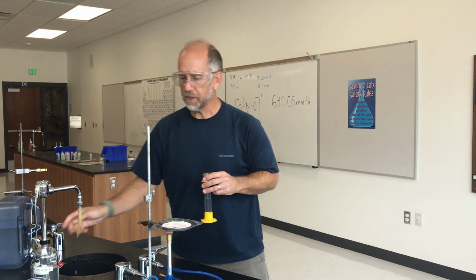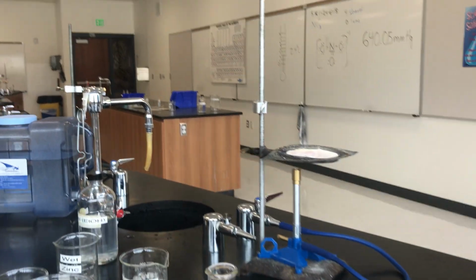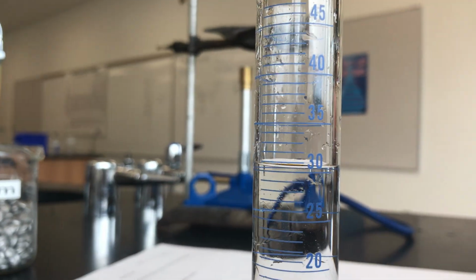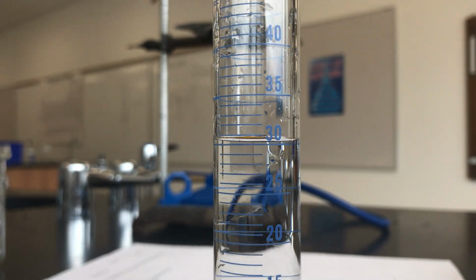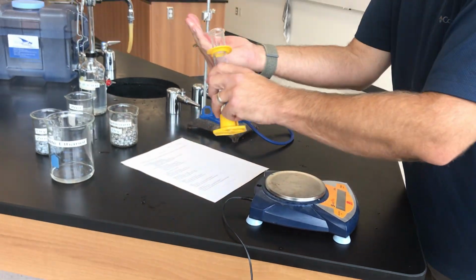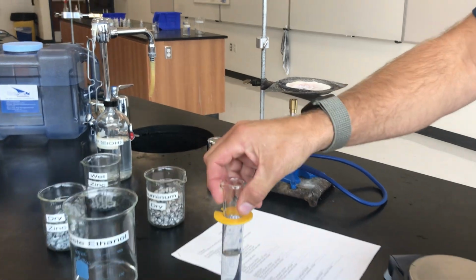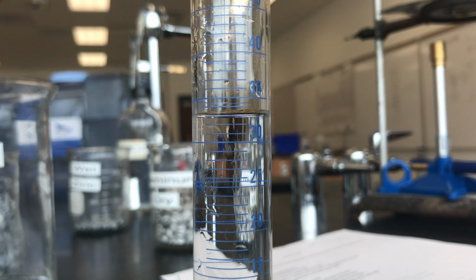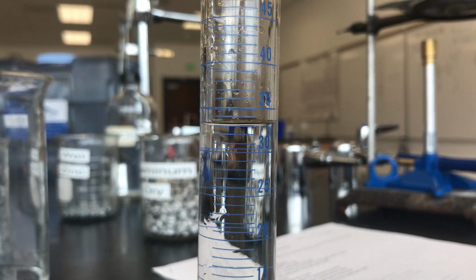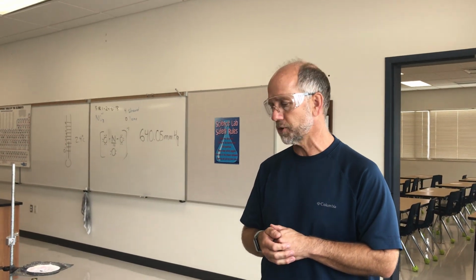We then once again place water in a graduated cylinder. We will read the volume of the water. And following that, we will slide the aluminum, missed a piece, slide the aluminum into the water, and record the volume of the water and the aluminum. That is actually the last piece of data that we need to complete the lab. We'll clean this up after we stop shooting.